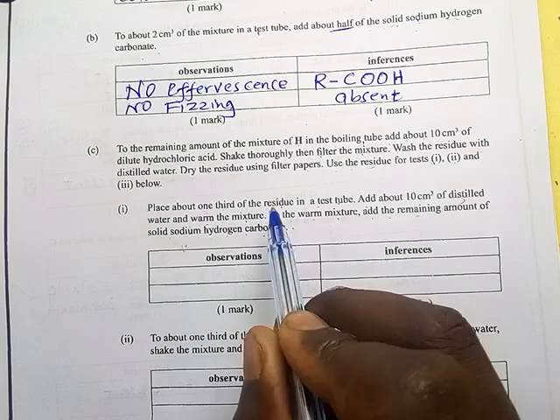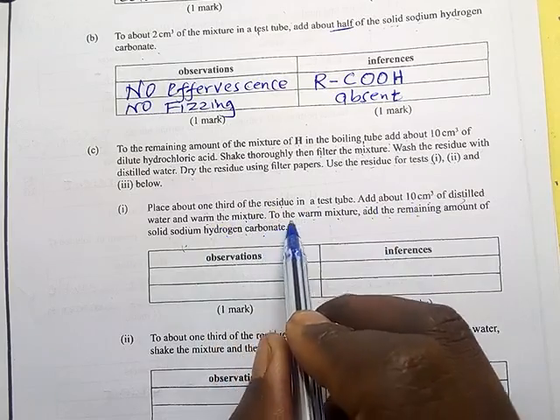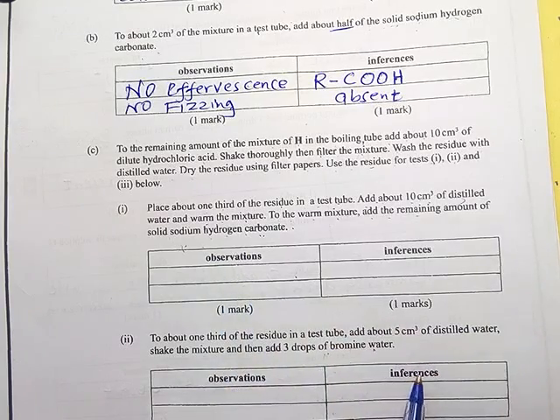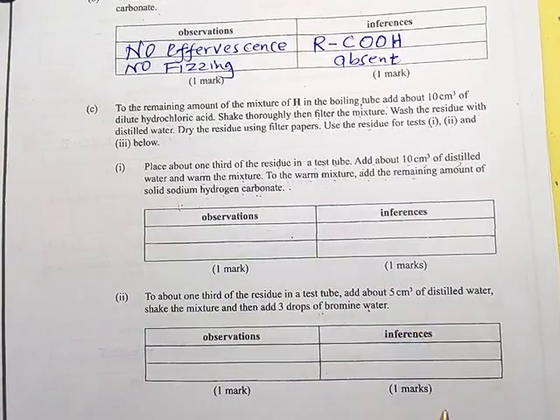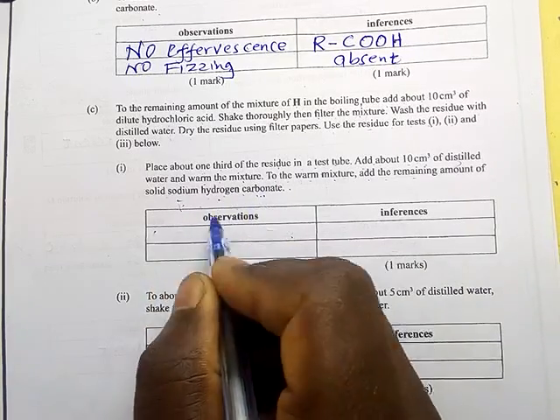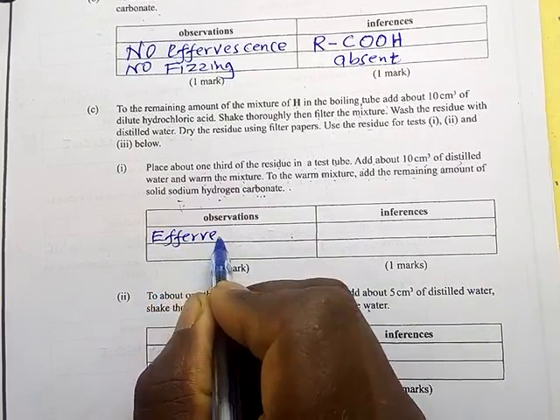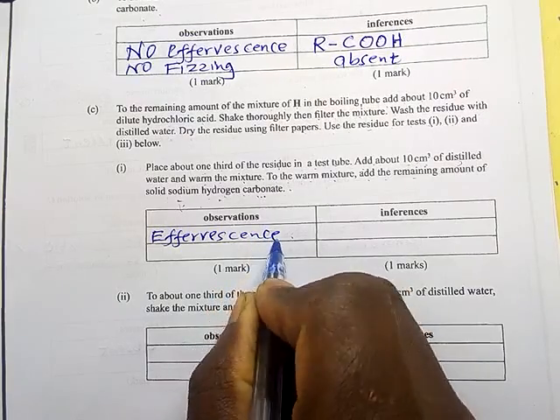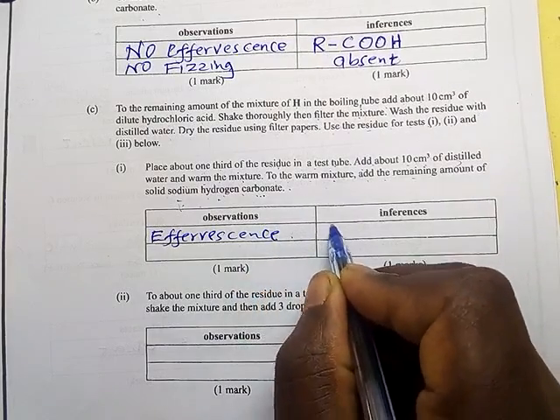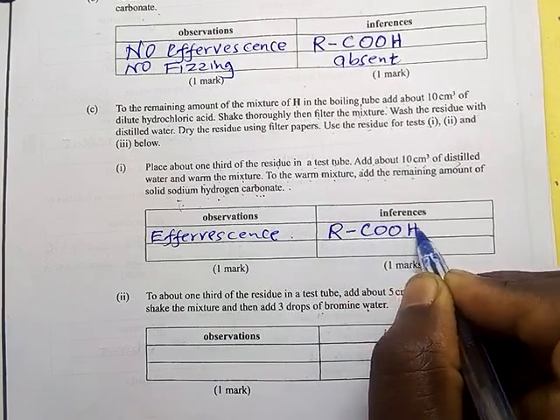Practical is just following instructions. If you are asked to add 10 centimeters, you add. You warm. To the mixture, add sodium hydrogen carbonate. Just following instructions, you will enjoy chemistry. So here, we are adding sodium hydrogen carbonate, therefore we expect effervescence or no effervescence. For this one, there was effervescence. So if there is effervescence, it means the RCOOH is present.